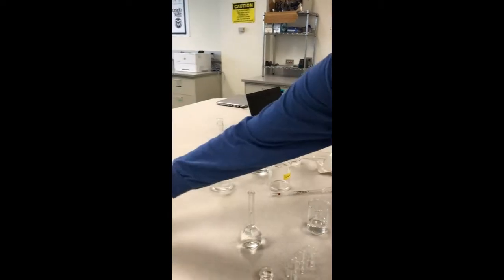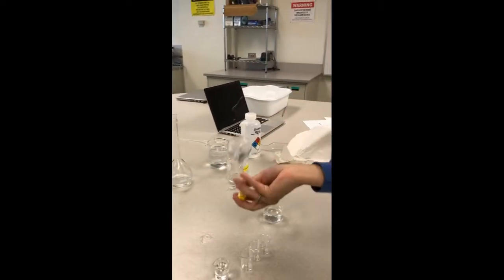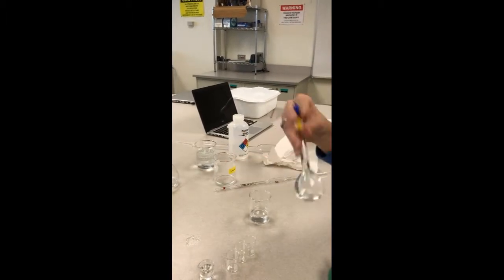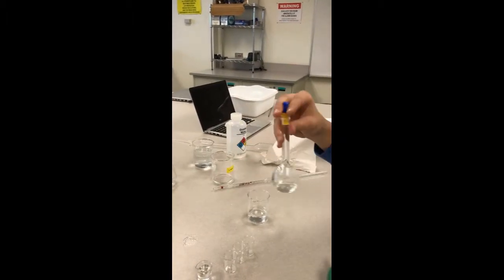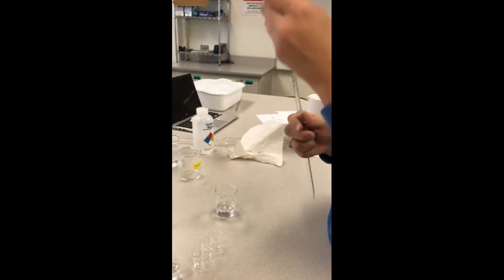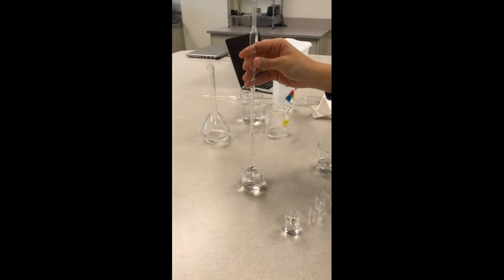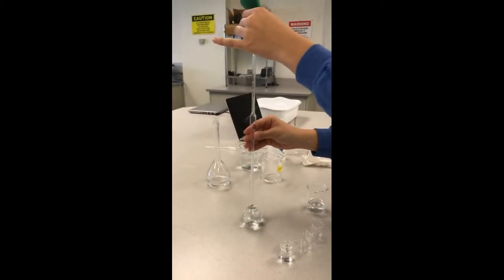We're then going to take the stopper and put it on the volumetric flask and invert it similarly to when we were making the solution. Once the solution is mixed, we're going to use the same 10 milliliter volumetric pipette and gather 10 milliliters of the new dilution.